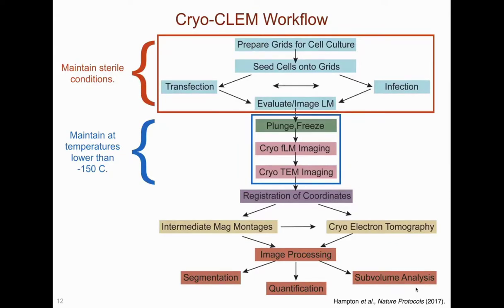How do we practically do cryo-CLEM? We have developed a cryo-CLEM workflow that includes standard operating procedures in areas that may require optimization to improve success rates of cryo-CLEM experiments for the novice and experienced practitioner. This workflow is conveniently color-coded to help the investigator work through each step and the associated steps of the process.